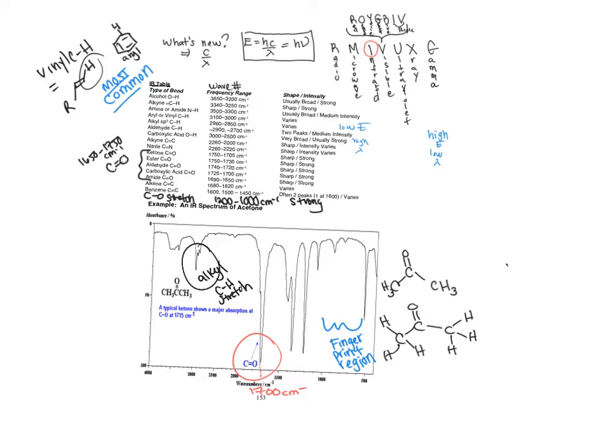Okay, so I have 3 types of bonds, and I've identified them. This one, and this one's not in the chart. So I'm done with interpreting the IR. I don't know why this is here, or this, or this. These are left alone. You just ignore them. You only look for ones that you can identify.